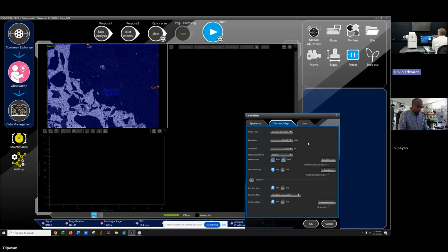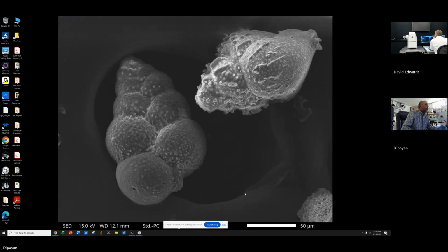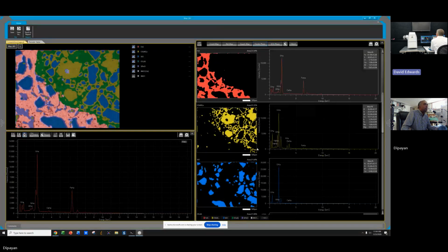There it is. Okay, so now I'll go back and look at yours. Close this. It's not here that you do it, there's another button. Go back to database management, open up a map. Yeah, you got a map, perfect. And then back up top where it says adjust, not the adjust button, but the circle next to it.